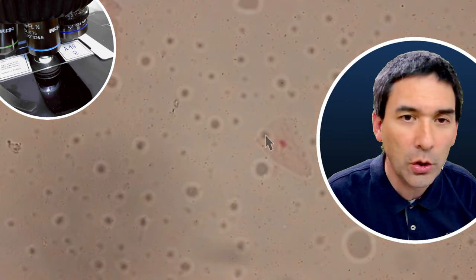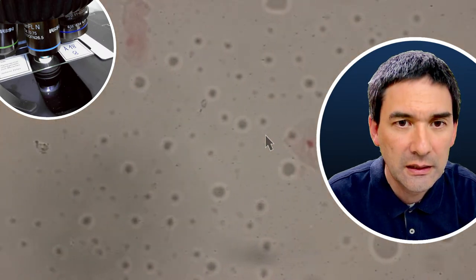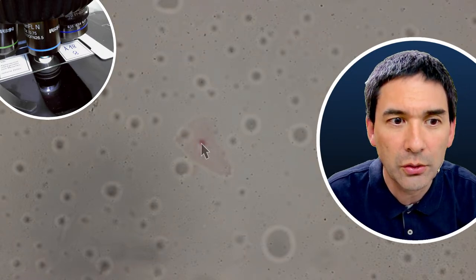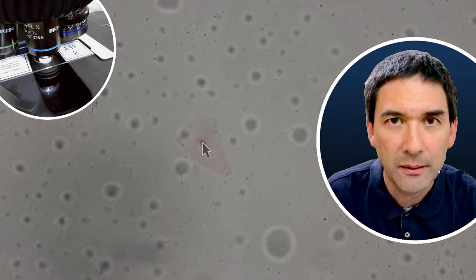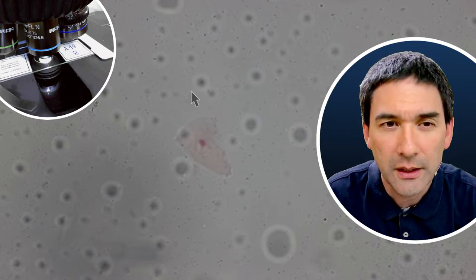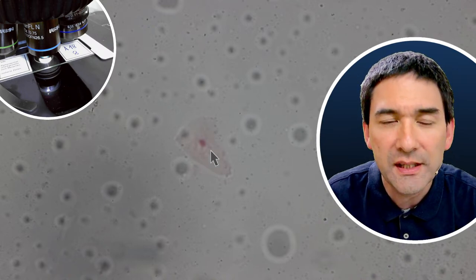And I'm going to switch over now to bright field. The condenser is all the way closed, okay? And what you see here, this here is one epithelial cell. And this dark dot that you see in the center, that's the nucleus. Now this is pretty disappointing, okay? And the reason why this is so difficult to see is because I would say that probably the refractive index of the surrounding medium and the cell is very similar.